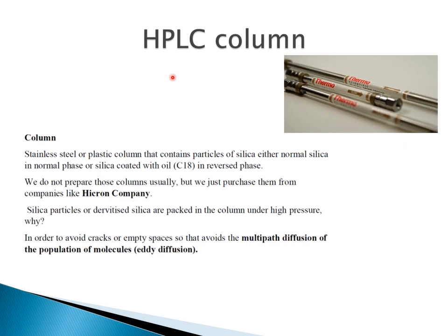Also, we have HPLC columns. Honestly, we don't fill the column by ourselves. Instead, there are some well-known companies we can purchase these columns from, and the technology of these columns is not primitive.